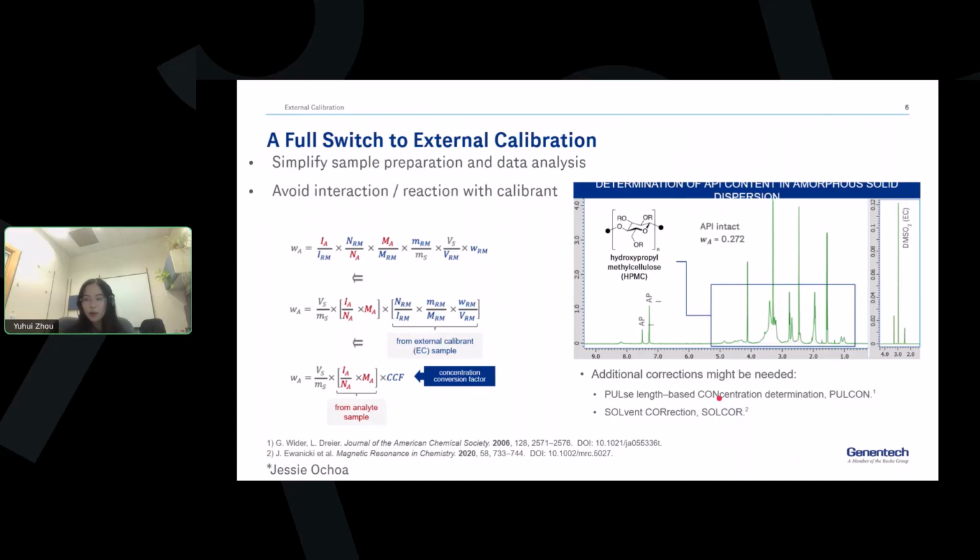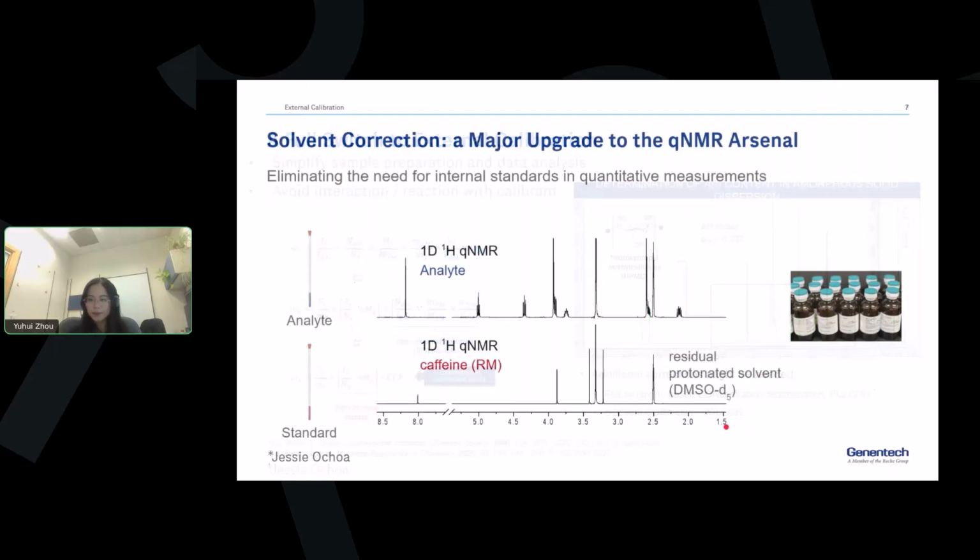In other words, pulse correction compensates for ionic strength difference between samples. And also, not all NMR tubes are made the same. We use solvent correction for variations in different NMR tubes. By implementing these corrections, we can be confident that our results are both accurate and reproducible.